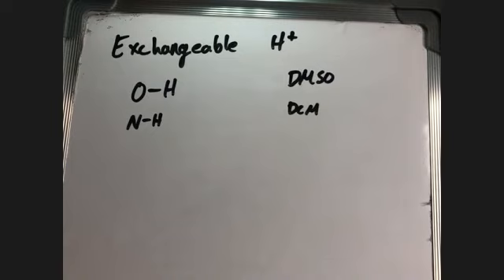And the issue is that this messes with your NMR, because your organic compound isn't the same at all times, because that proton is sometimes on that oxygen, sometimes not, and so on. The best analogy I've ever heard for interpreting this is taking a picture of something that's moving very quickly, like a racehorse. If your shutter speed isn't sufficiently fast, then you're not going to get a clear image of the horse. What you're going to get is a blurred image of the moving figure, right?